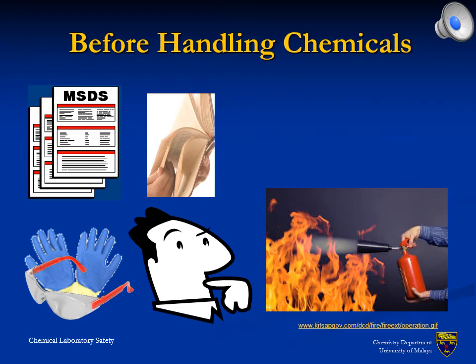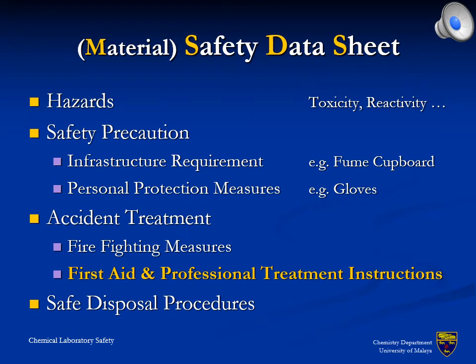Preparation for experiments inside a chemical laboratory involves not only the procedures, but also consideration of possible accidents and planning of a response for the latter. Most importantly, the hazard of the chemicals which shall be used needs to be studied prior to any operation in the lab. Information can be obtained from so-called material safety data sheets. The documents provide information regarding potential hazards as well as instructions for safe operation and emergency response measures.